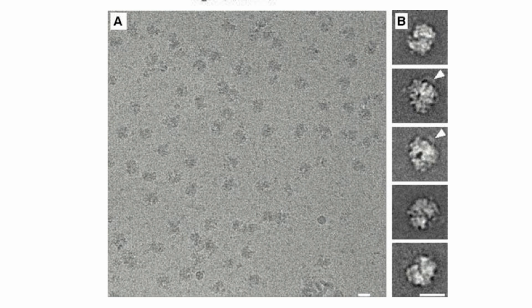You signal average over all of these different molecules, and over all of the different orientations of the protein that are trapped in your static electron microscope image. Then, using some image processing, you generate a 3-dimensional image of your protein that has a higher resolution than what you can see with one single photo. There's a lot of computer processing that happens behind the scenes.